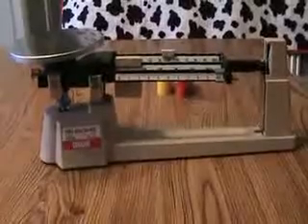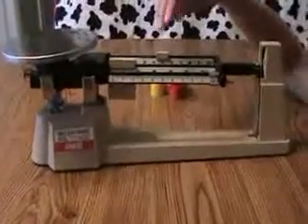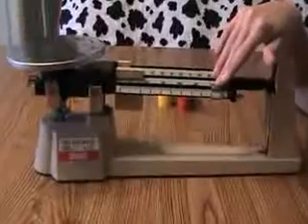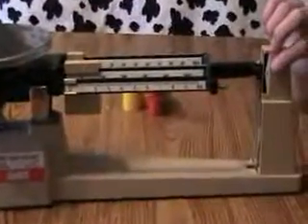The first step in using the triple beam balance is to make sure all the weights are on the correct side. In this case, our weights were moved over, so we have to move them to the zero. Then we're going to check that the line lines up at zero.